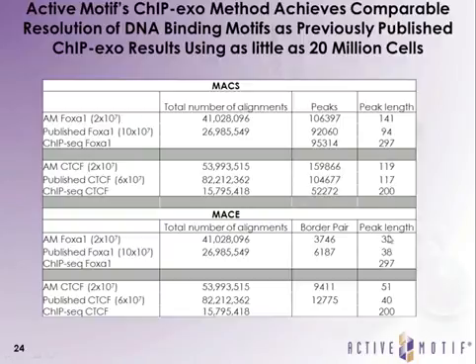Yet if you use the ChIP-Exo specific program, such as MACE, as we see here, you're able to identify using this algorithm that looks more at the border buildups and the protection site. You see that the identified peak length is about 33 base pairs, 38, which is much improved over that which you would see in traditional ChIP-Seq. As we see here, you also see it in CTCF.